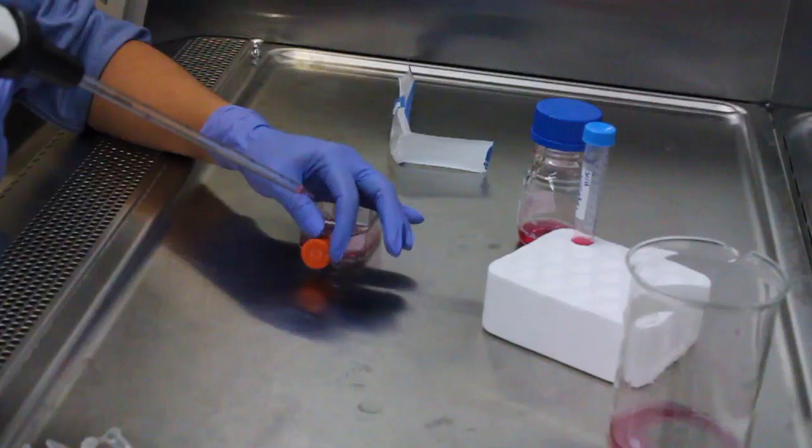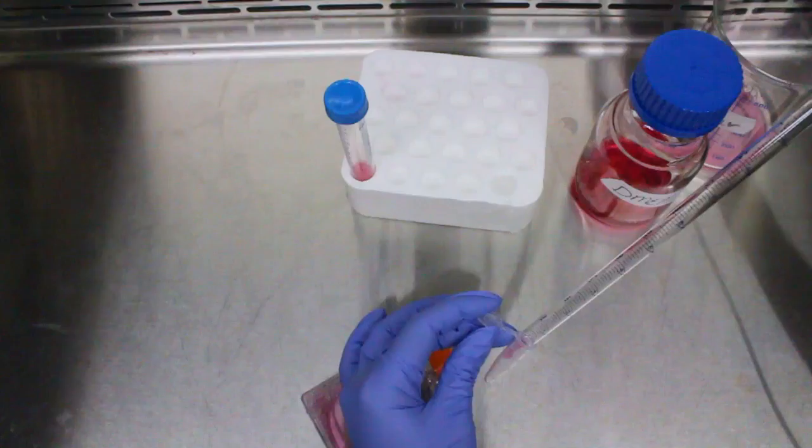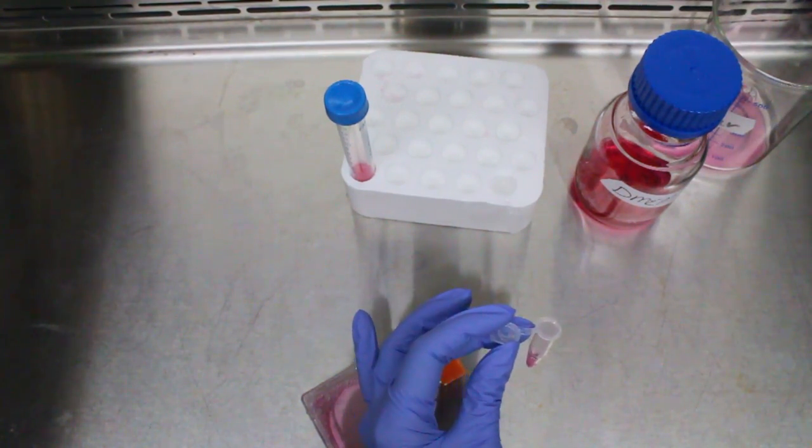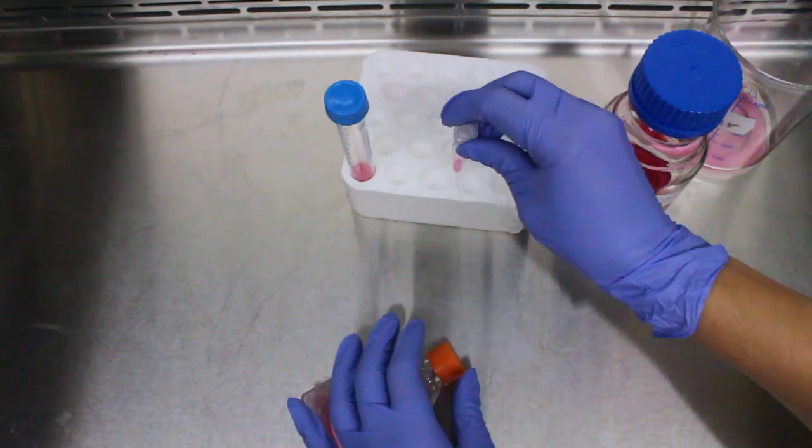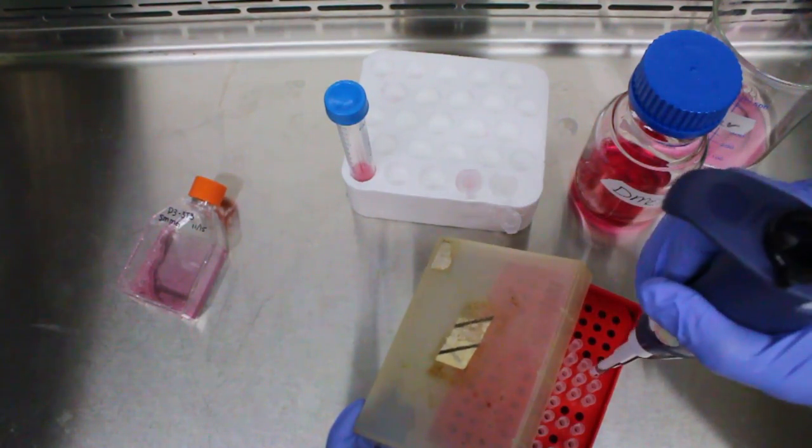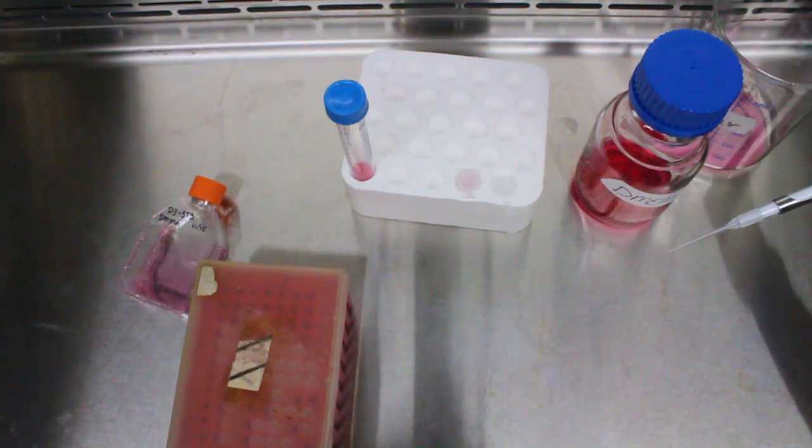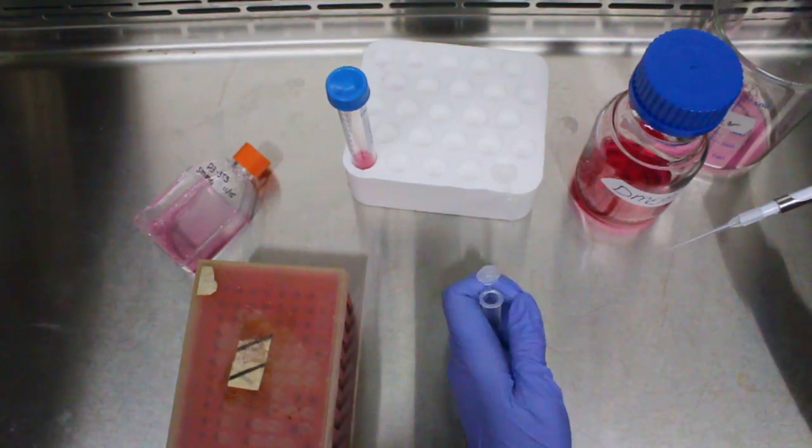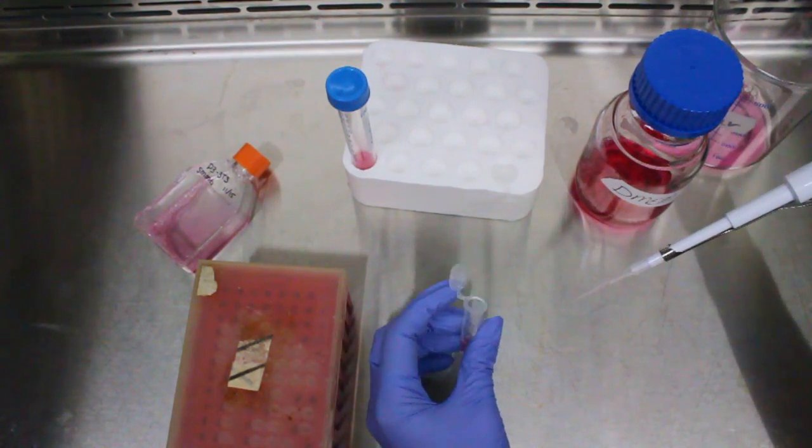In order to properly assess cell count, remove a small amount and place it into an MC15 tube. Using a micropipetter, grab a new pipette tip and be sure that it is set to 10 microliters. Remove 10 microliters of the sample from the MC15 and place it into a new MC15.